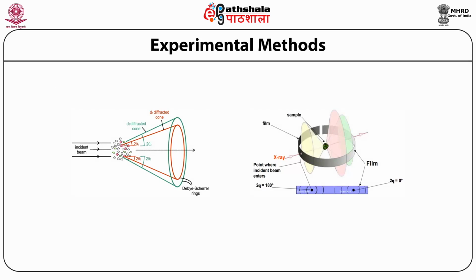More than one powder crystallite may be so oriented that their HKL planes make the correct Bragg angle for the reflection. If this plane is now rotated about the incident beam as the axis of rotation in such a way that the angle is kept constant, then the reflected beam will travel over the surface of a cone where the axis of the cone coincides with the transmitted beam. Though the rotation doesn't actually occur in the powder method, the presence of a large number of crystallites in the powder sample having all possible orientations is equivalent to this rotation.